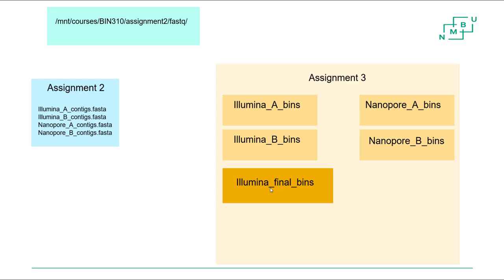And remember, these numbers that these binning tools add to the file names, they mean nothing, right? It's just a label. So it's not like bin number 1 up here has anything to do with bin number 1 down here. These numbers have no meaning at all. It's just labels. So you can easily have the same name, right?